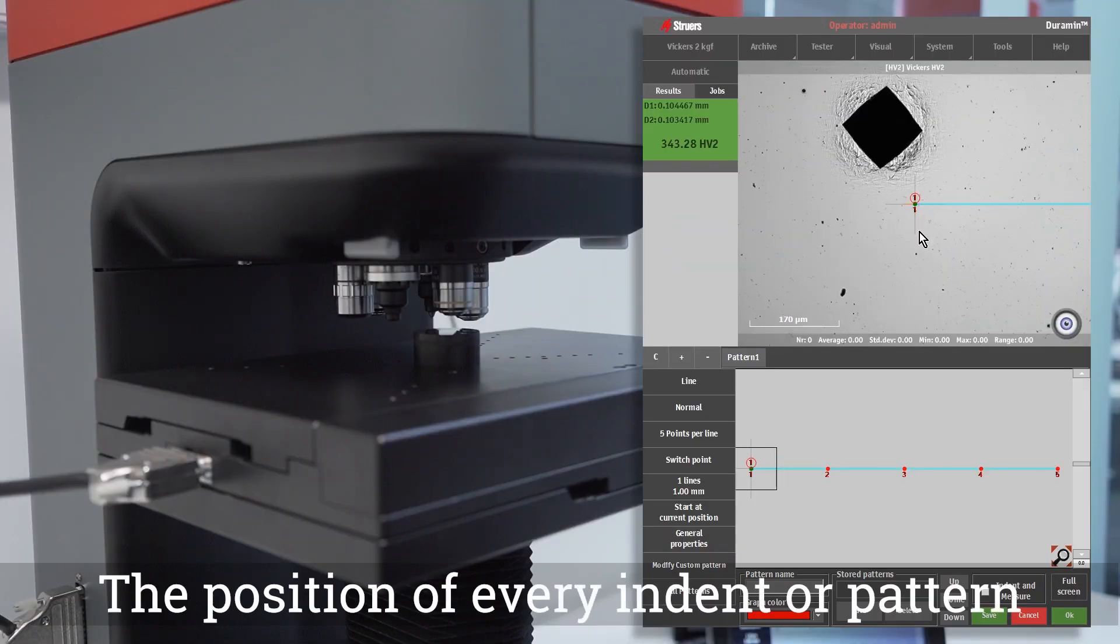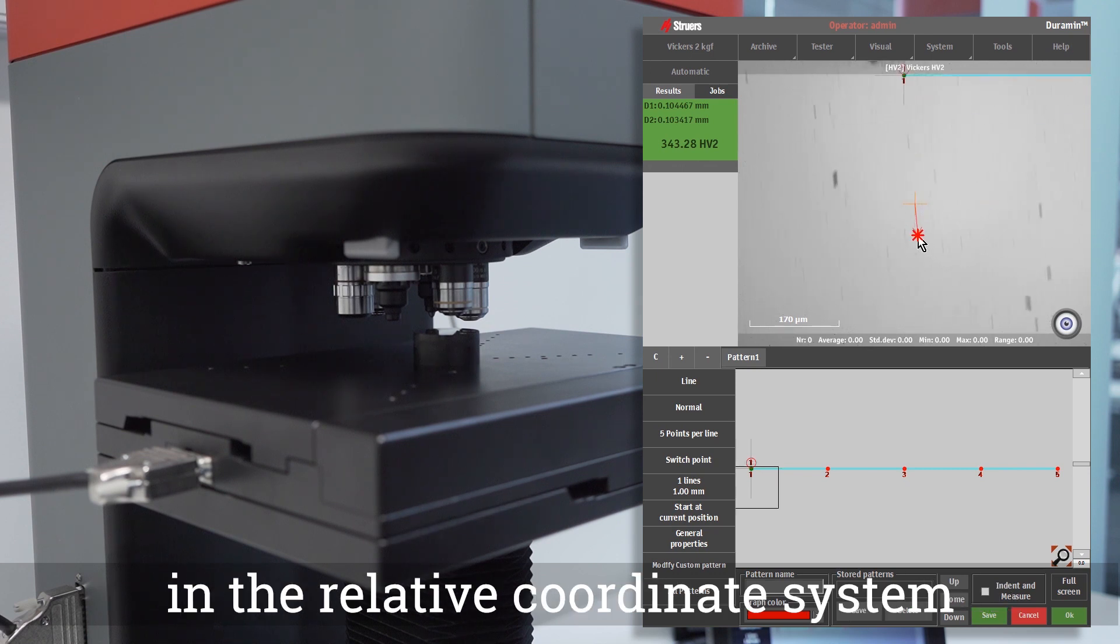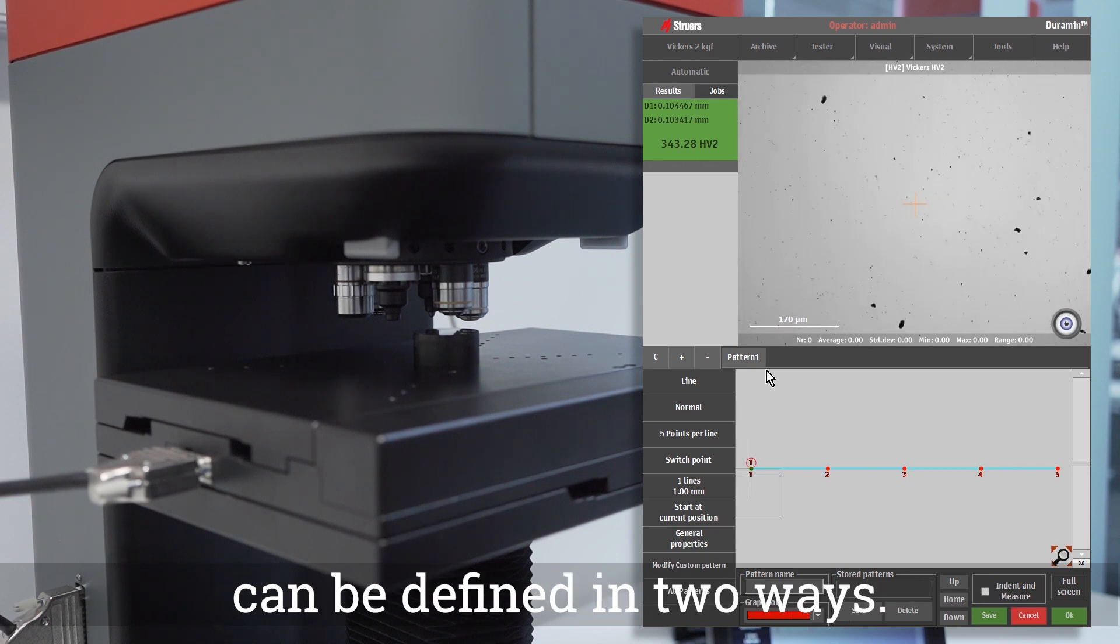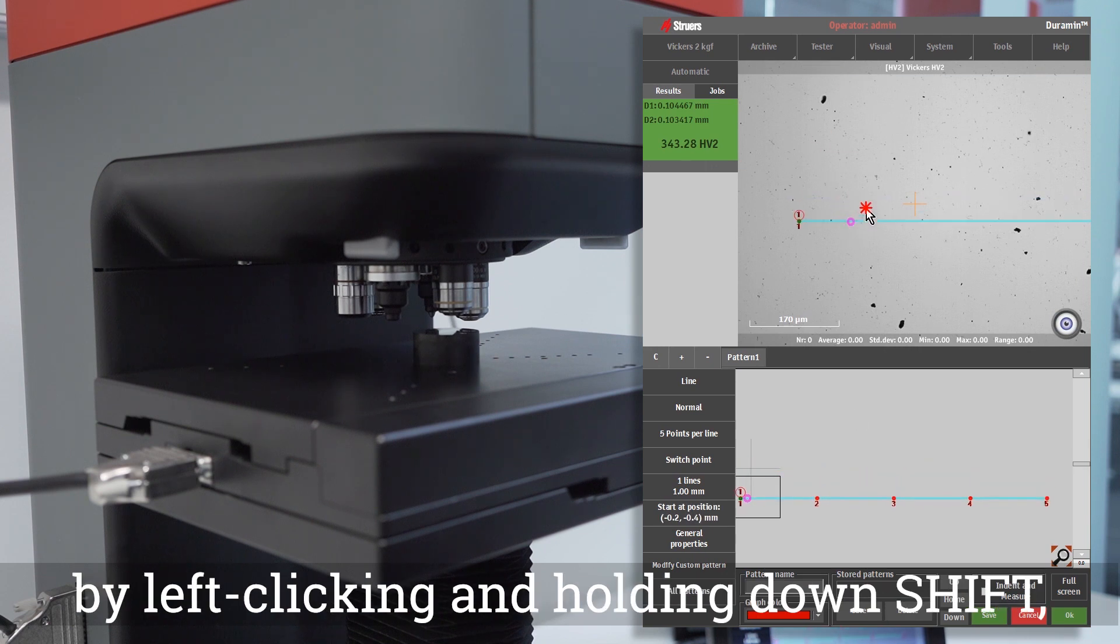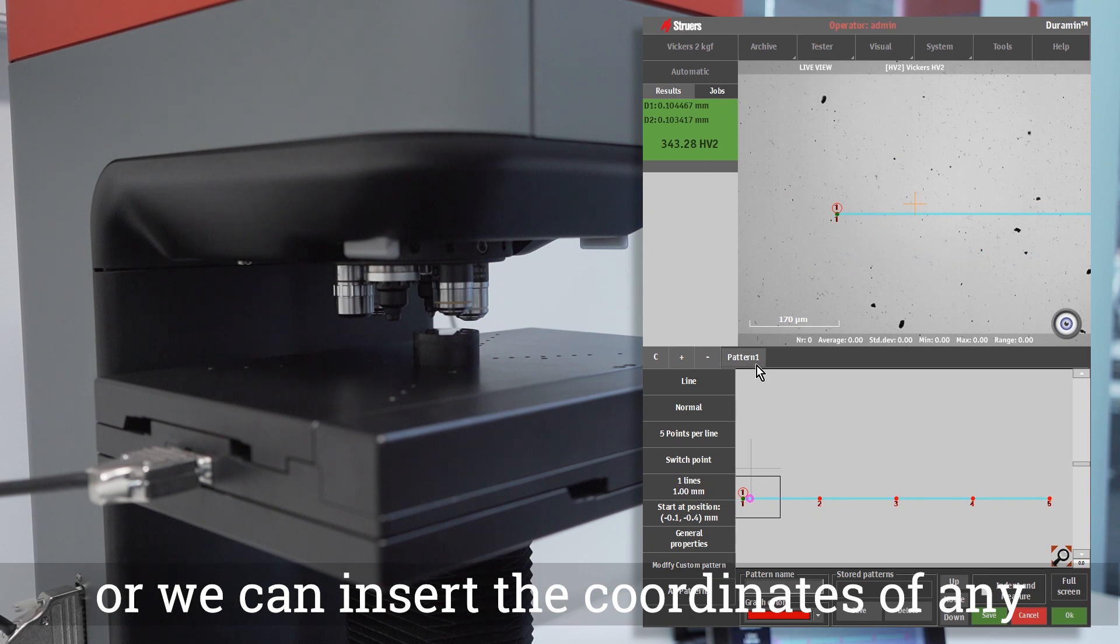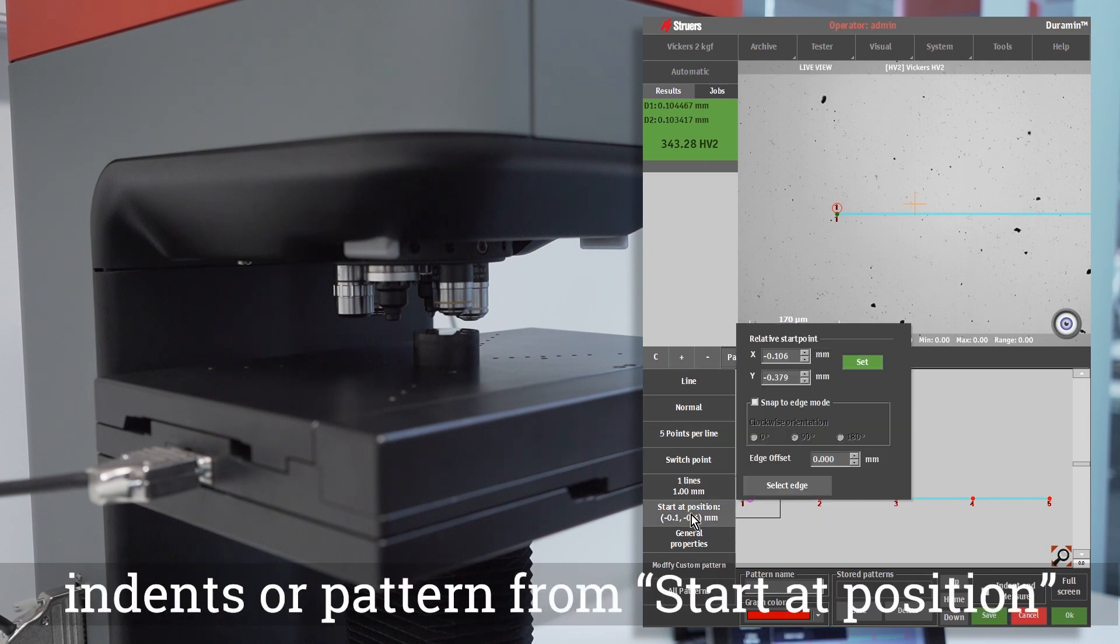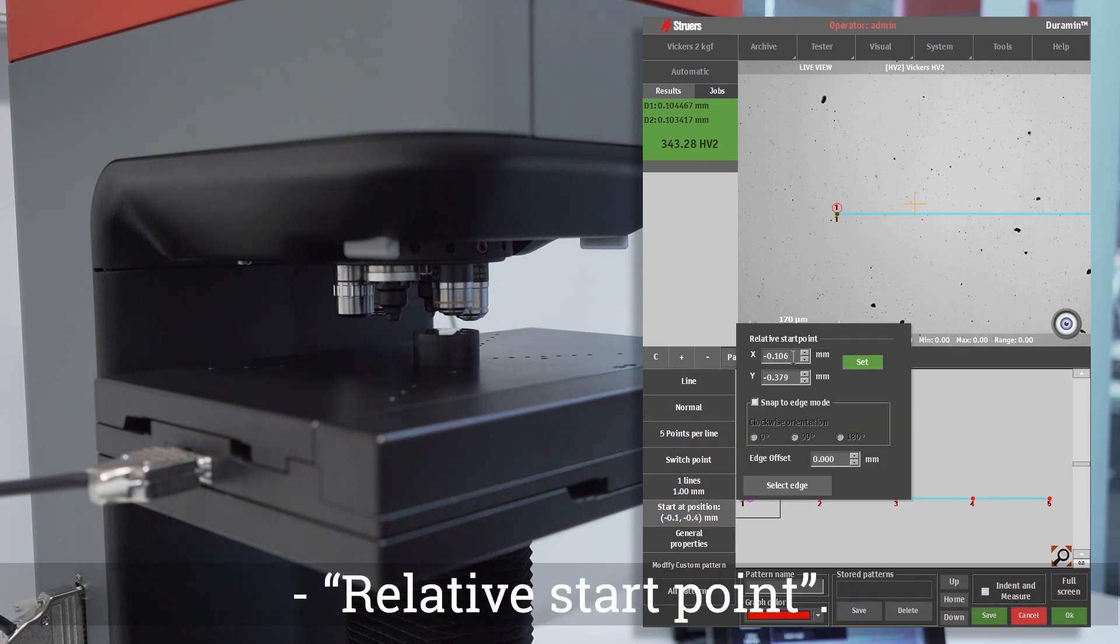The position of every indent or pattern in the relative coordinate system can be defined in two ways. We can simply drag an indent or a pattern by left clicking and holding down Shift, or we can insert the coordinates of any indent or pattern from start at position relative start point.